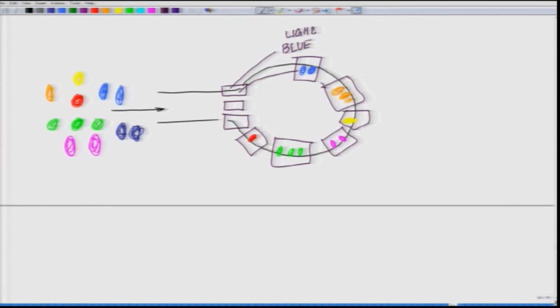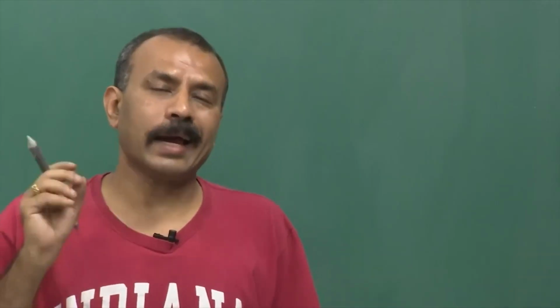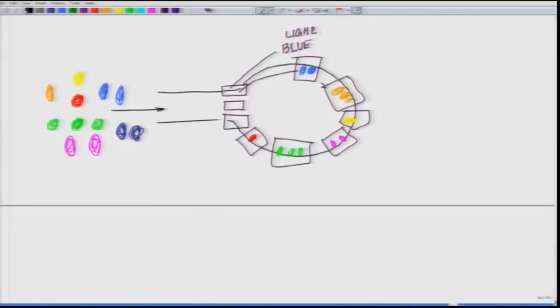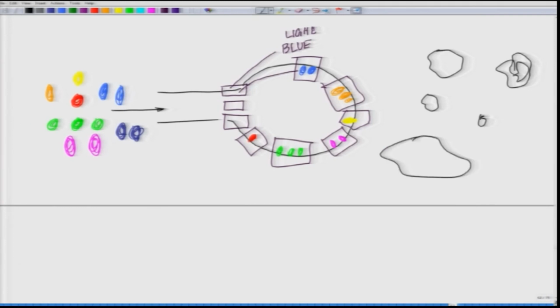But location is not an issue. The issue is how you separate them out, that is the most critical point. In order to separate them out, the first thing one has to do, if you get these specific cell types, say I get this, this, this, this, this, so there are 5 cell types, say A, B, C, D, E. I told you one option I have is that I separate them out by density gradient, which is actually possible.